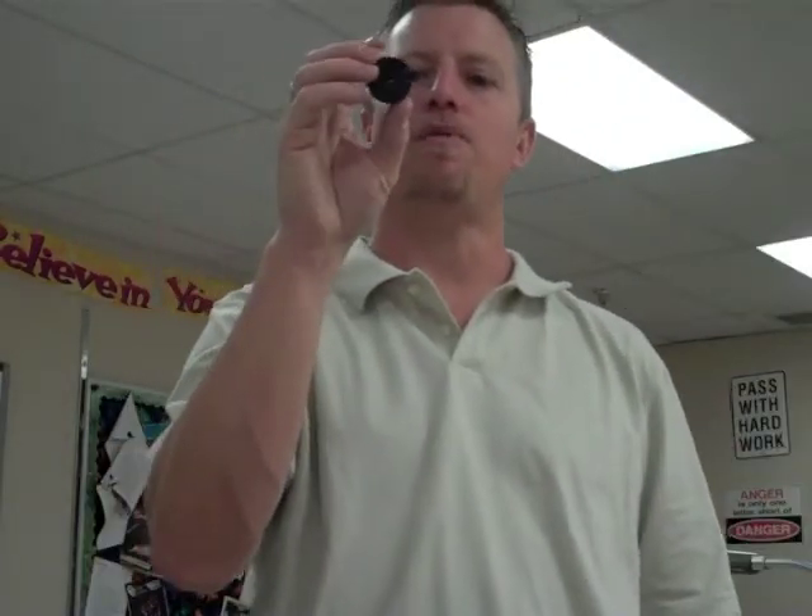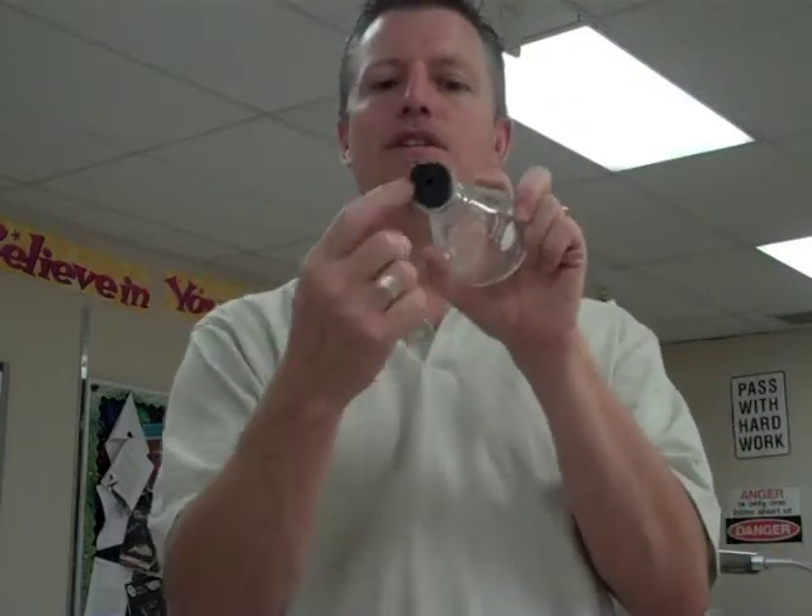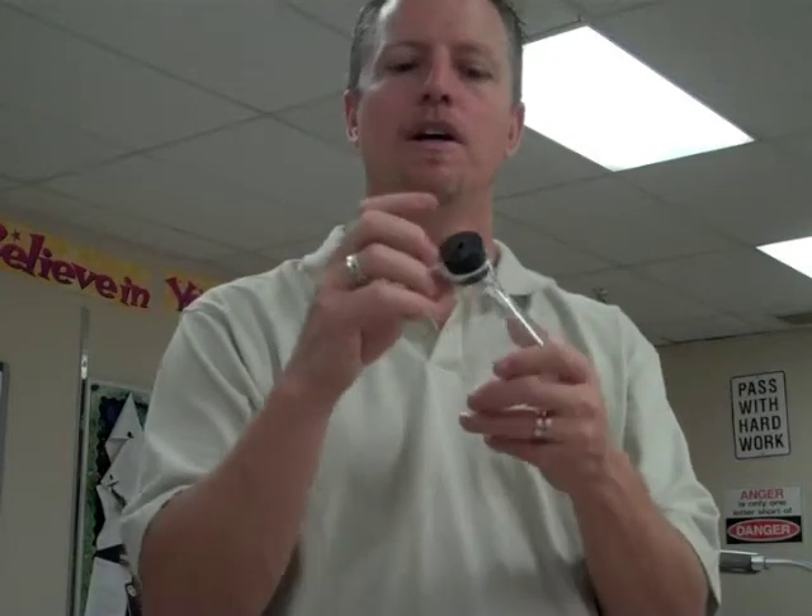This is just a rubber stopper. Rubber stoppers are used on the tops of flasks and test tubes to maintain the contents inside and prevent spills. This one has a hole in the top, which allows us to insert a glass tube so we can run hoses off of it. If we're evaporating something or have a chemical reaction and want to capture the resulting gas, the rubber stopper allows us to do just that.